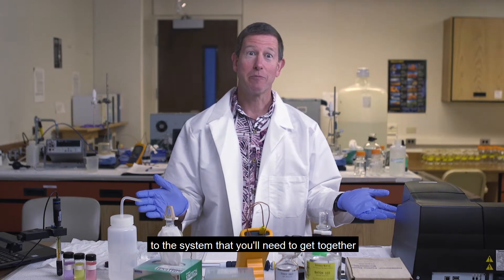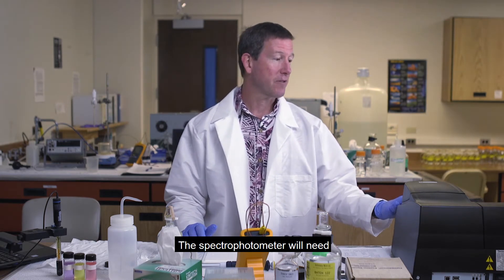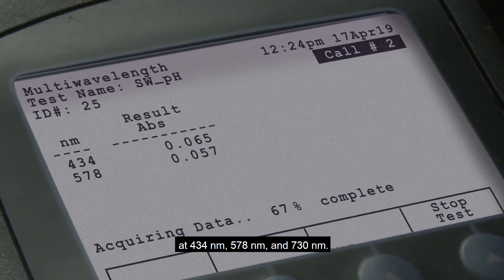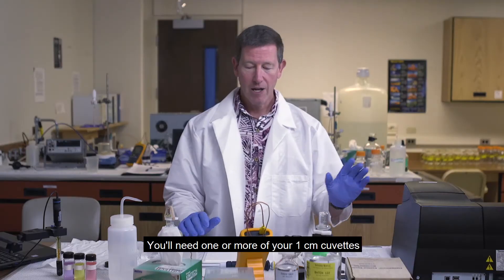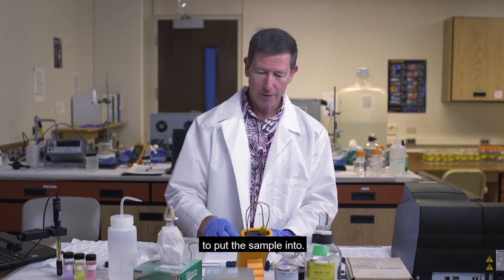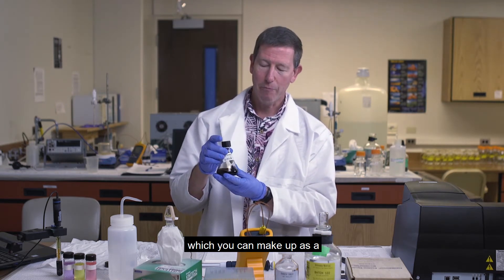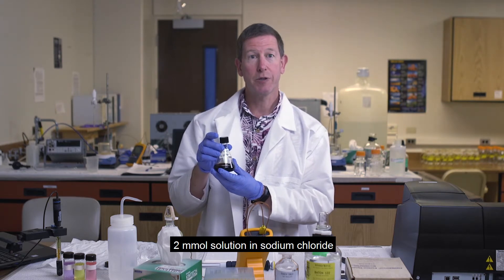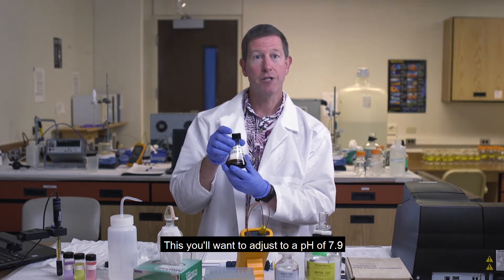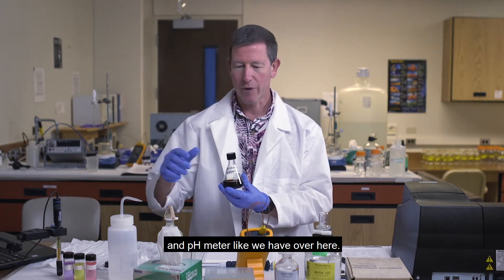There are several components to the system that you'll need to get together before you do the measurement. Of course, you'll need a spectrophotometer. The spectrophotometer will need to be programmed to make measurements at 434 nanometers, 578 nanometers, and 730 nanometers. You'll also need your M-Cresol purple dye, which you can make up as a 2 millimolar solution in sodium chloride so that it's got the same ionic strength as seawater. You'll want to adjust this to a pH of 7.9, which you can do with a standard electrode and pH meter.